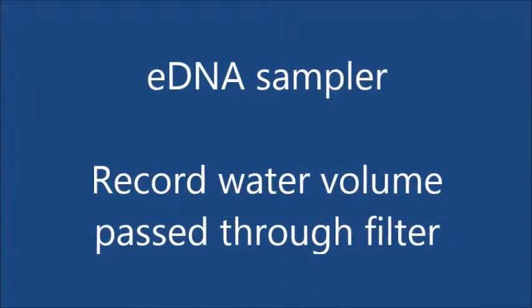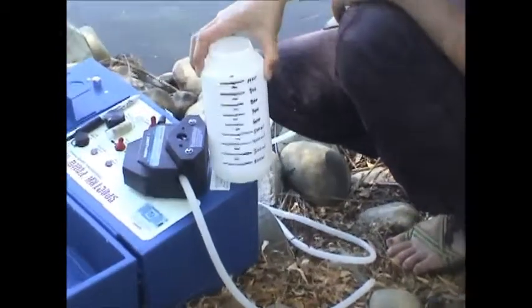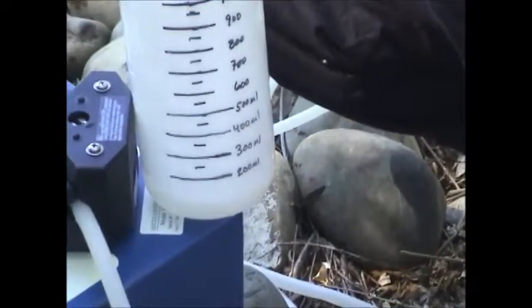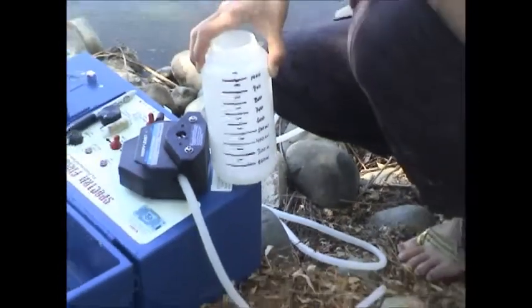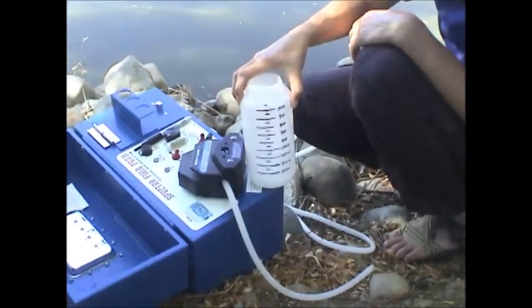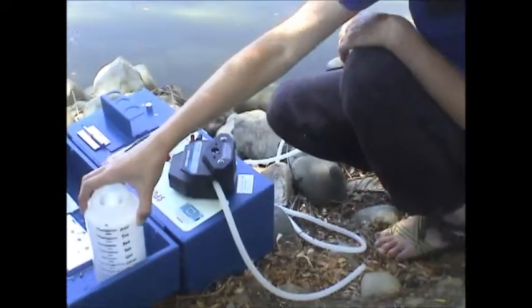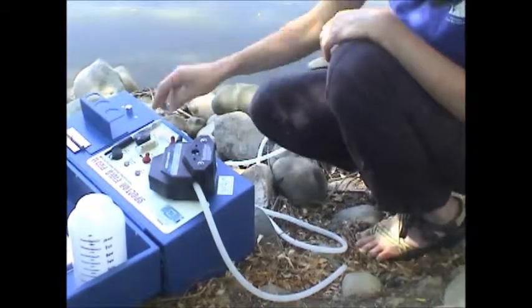The last thing some folks may want to do is record the amount of water that was filtered. You're not just doing presence/absence — you can also do quantity. Just note how much water you put through the filter. I have a simple graduated Nalgene bottle here. Note the volume that you passed and write that right on the column.